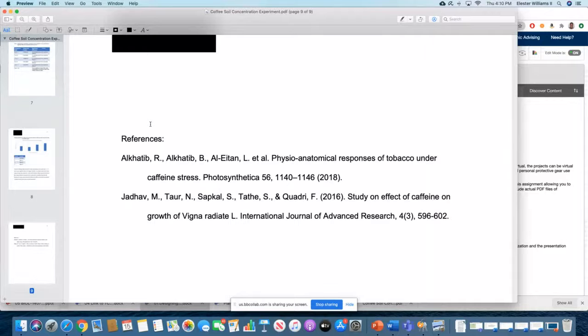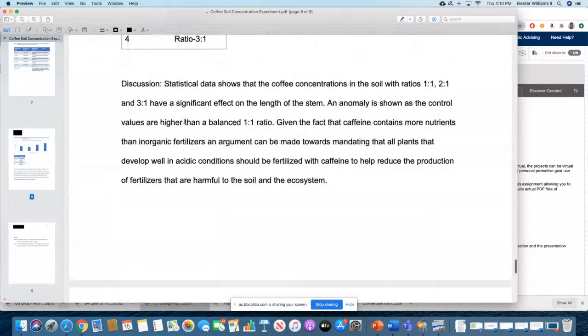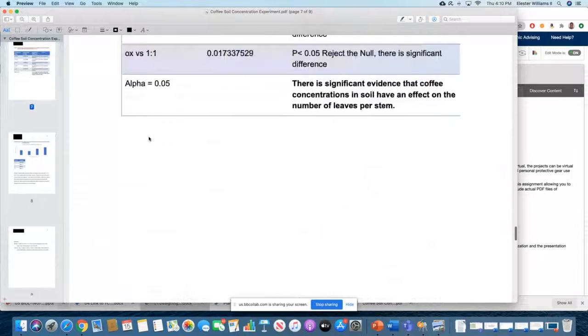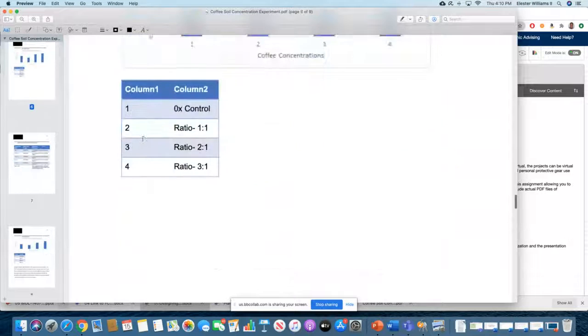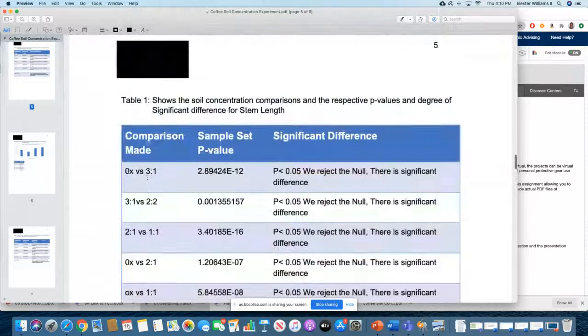It would be interesting to link it back to the source. Or you would conduct this experiment another time with more concentrations or even different concentrations, maybe even doing linear regression on it and seeing how strongly the data was giving you a linear predictable relationship.